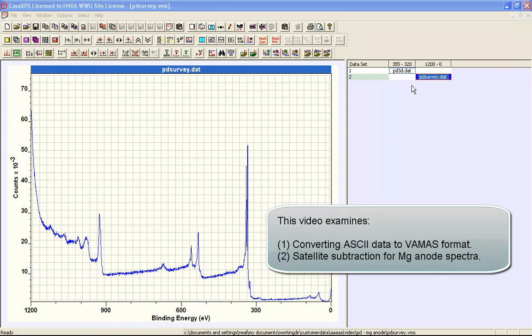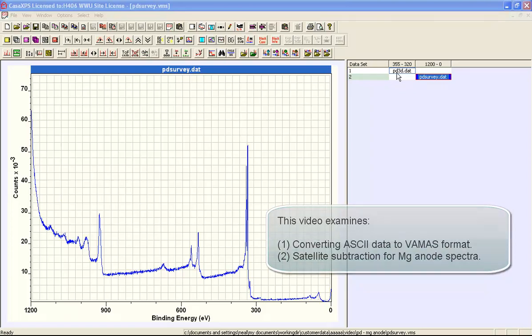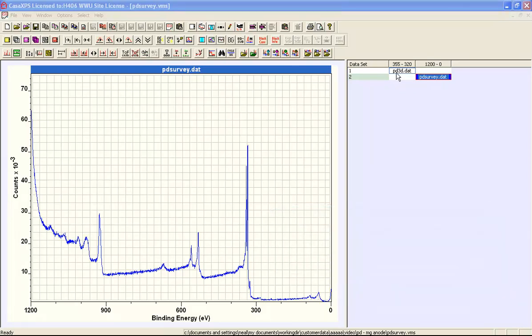This is an example of a VAMAS file that has been created from a pair of ASCII files. Each file contains binding energy and counts per second. The binding energy is uniform in step size and corresponding to each binding energy we have an intensity which is in counts per second.